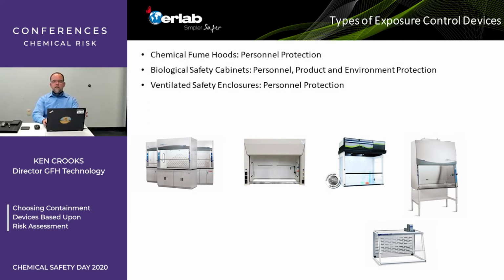The ventilated safety enclosures come in all sorts of different forms, and this is really just for minor use, nuisance odors, personnel protection. What just popped up on the screen is a small ventilated enclosure that goes on the work surface in an undergraduate, low hazard teaching type laboratory. It still is exhausted and ducted to the outside, needs fans and HVAC, but low cost. Not a chemical fume hood, it doesn't have services, gas, water, vacuum, that sort of thing.